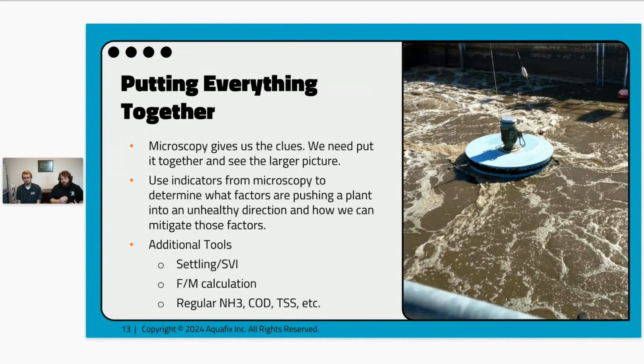And so, I mentioned earlier that microscopy is a tool in your tool belt. When we finish everything under the microscope and you take a look at the floc, your filaments, your bulk liquid, your Metazoa and Protozoa, your free bacteria, all that extra stuff, we need to put that whole picture together to figure out what's going on in your system, recognize what things are important and what things aren't important. Ultimately, at Aquafix, our goal is to provide recommendations to the operators on how to improve their system. For an operator doing microscopy, your main goal would be, how has my microscopy changed from the last time I did microscopy?